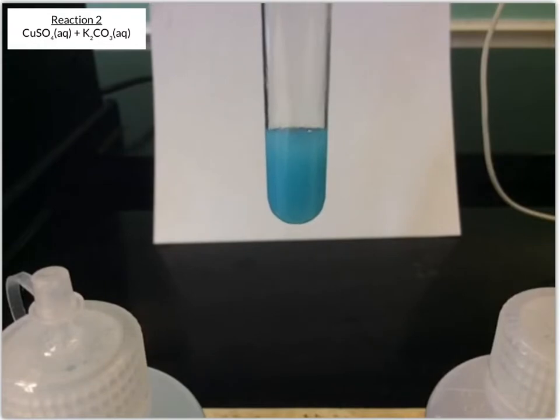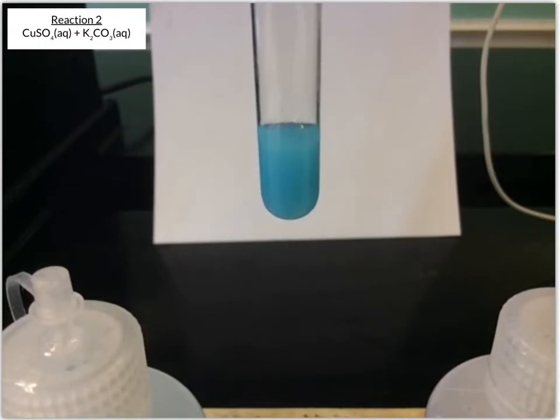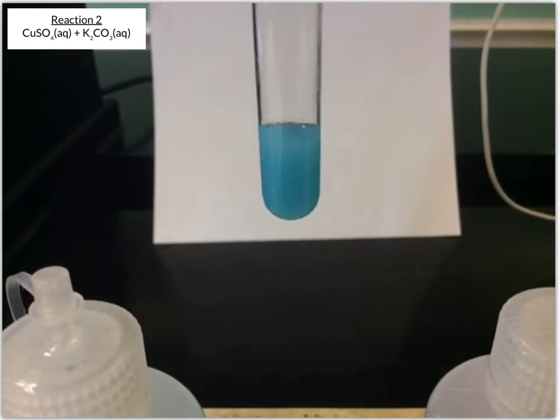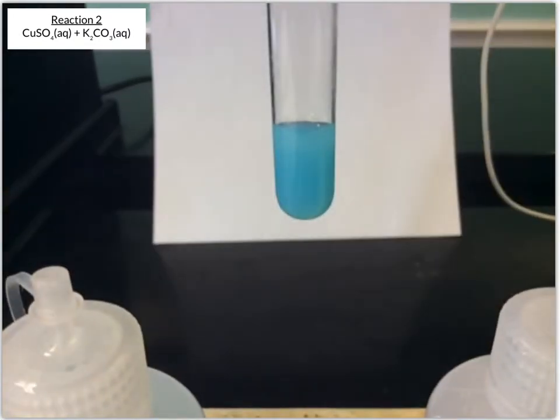But if you look really close, you can see it's got stuff clinging to the edges of the test tube where I stirred. And that's because there's some solid in there floating around. And I caught some of it on the stirring rod, and it's up on the edges of the tube. But just like the first one, we'll go ahead and give it a few minutes, give it a chance to settle a little bit, because the solid in there should start to settle to where you can tell definitely there's solid in that solution.